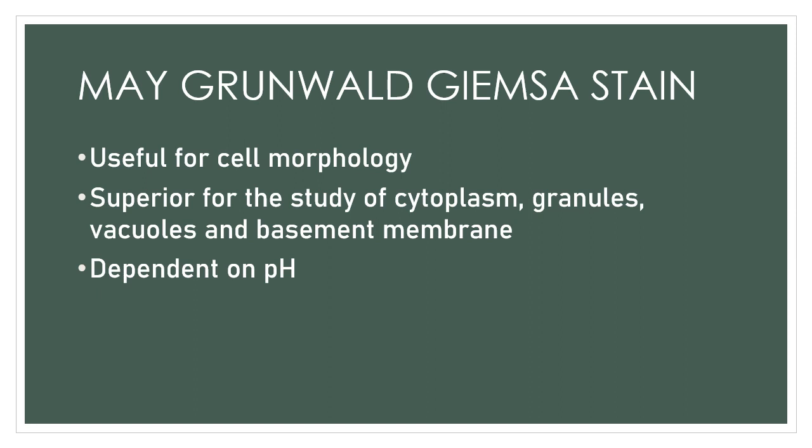Your May Grunwald stain is superior for the study of cytoplasm, granules, vacuoles, and basement membrane, compared to your Papanicolaou. But for nuclear staining, May Grunwald is inferior to your Papanicolaou; Papanicolaou is superior in nuclear staining.